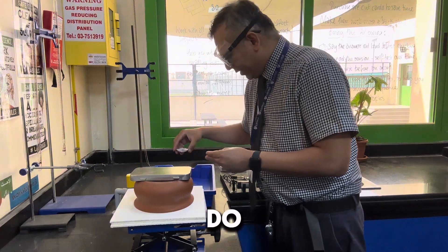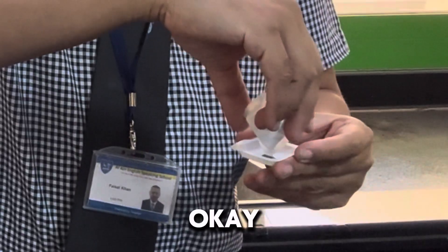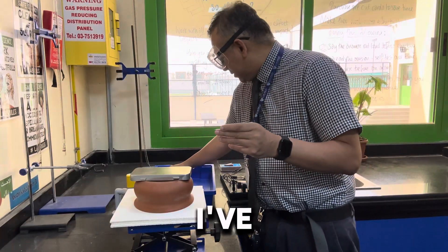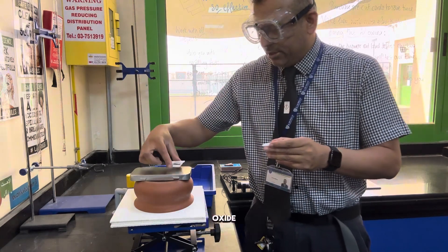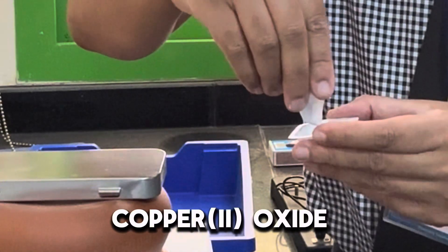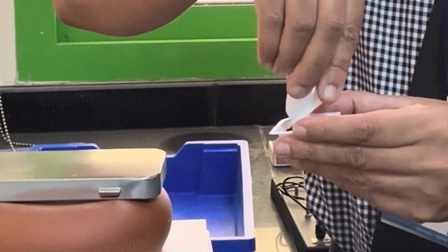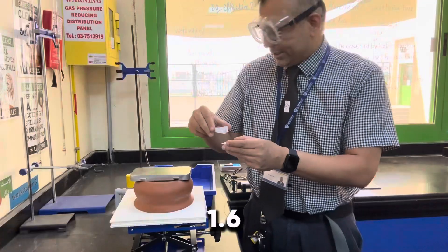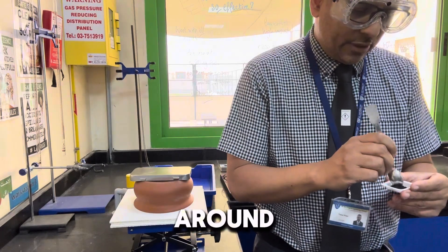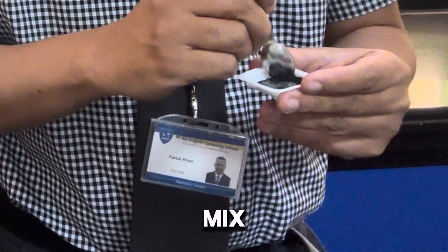So what I'm going to do is, I've got this zinc and I've got the copper oxide — which when you're grown up will be called copper 2 oxide. I've got around about 1.6 grams of copper 2 oxide and around about 2 grams of zinc. And all I'm going to do, first of all, is mix it up.